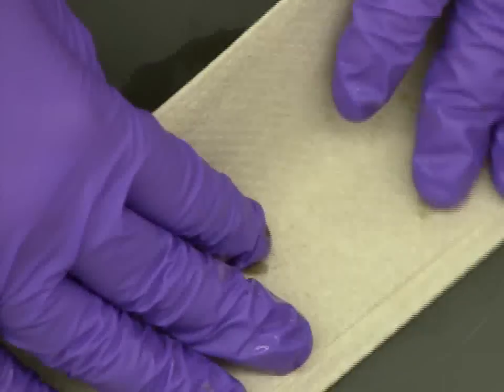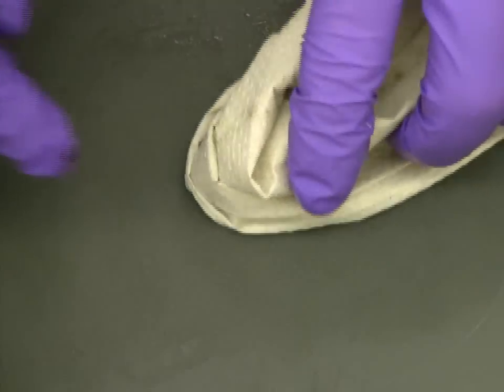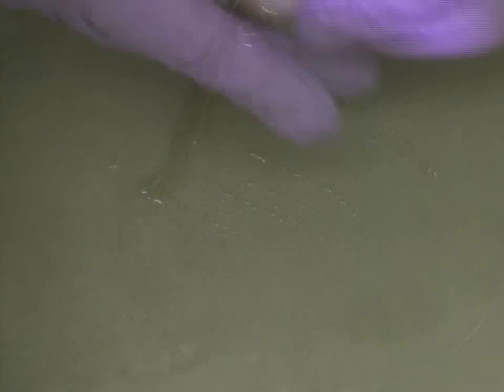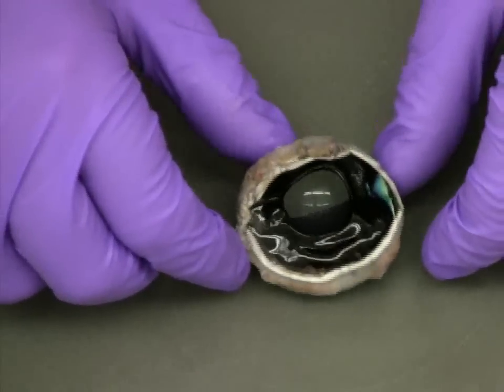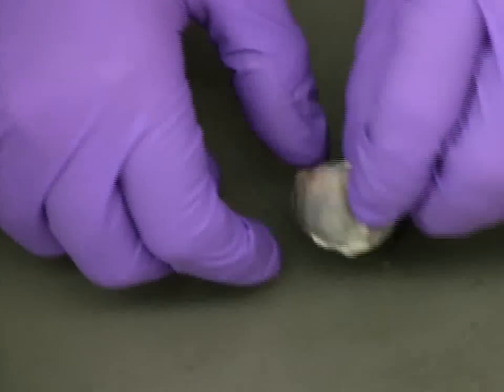Once the vitreous humor is removed from the eye, it will most likely be fairly spread out, so it's important to clean up your workspace before proceeding with the next step of the dissection. With the vitreous humor removed, the clear lens is now easily visible along with the iris.